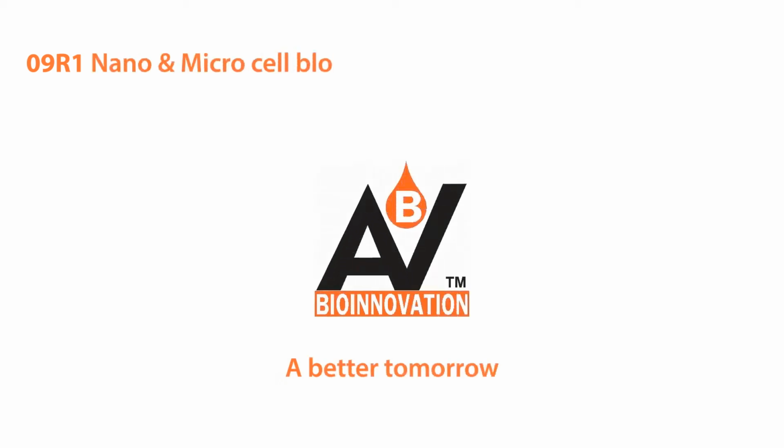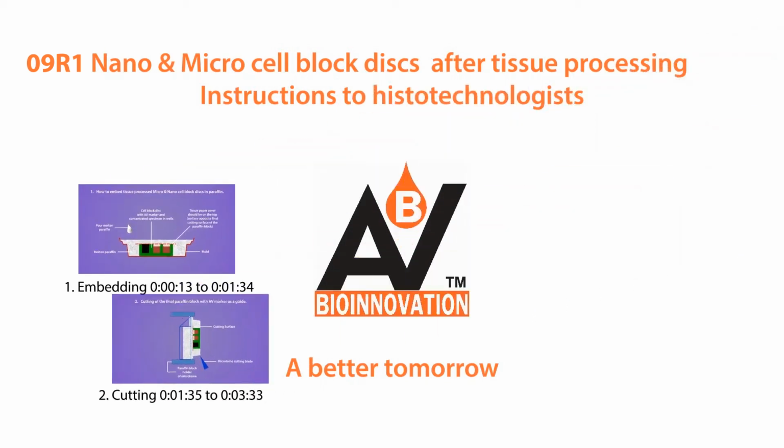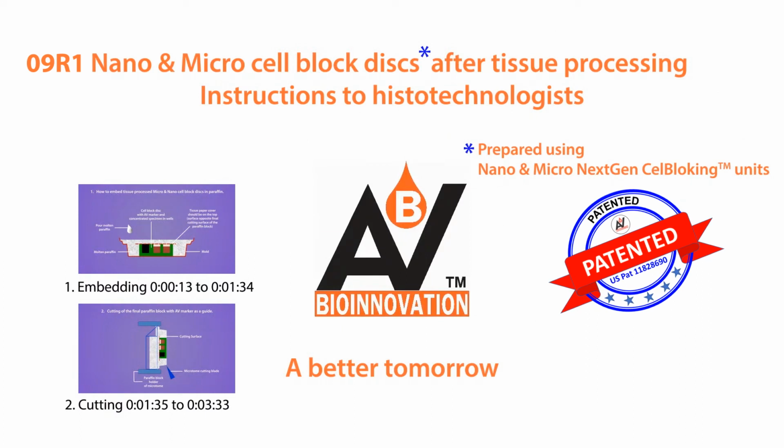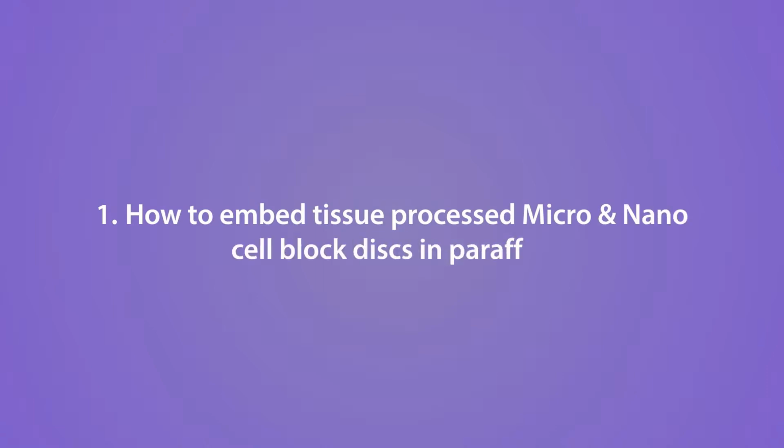Nano and micro cell block discs after tissue processing. Instructions to histotechnologists. How to embed tissue processed, micro and nano cell block discs in paraffin.